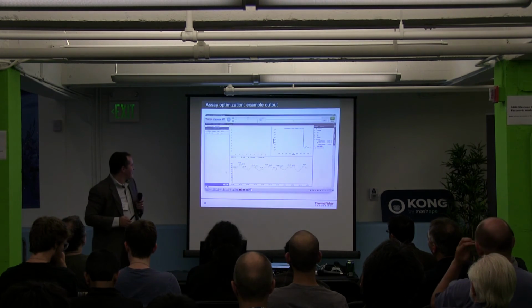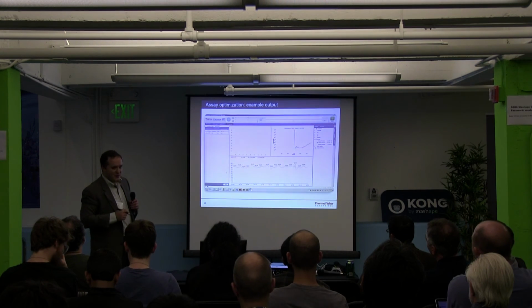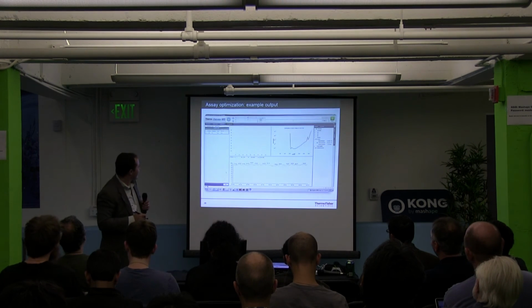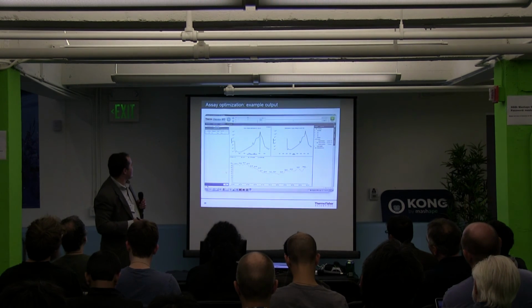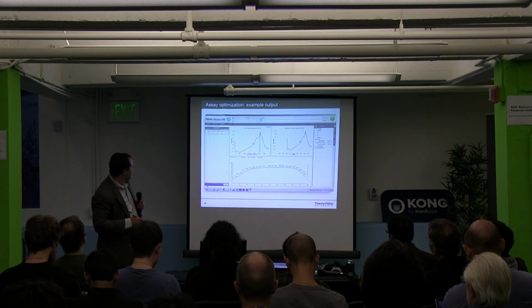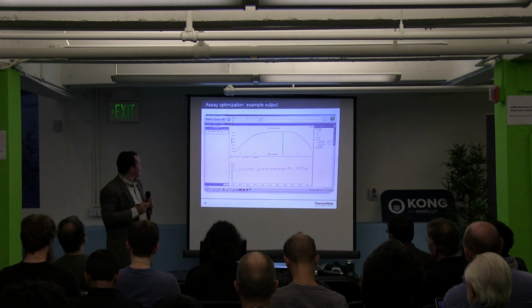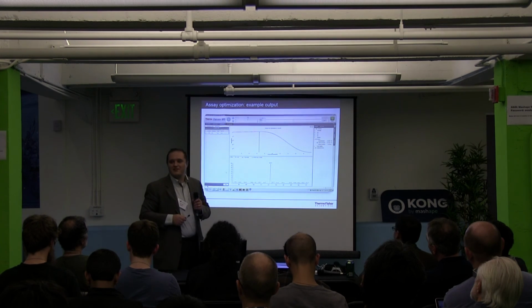Each step we see here is a run of an optimization function. So it's spray voltage, that's one. It's only a minute long. This is the longest step. Okay, it comes back, sets the state, runs another, and so on. So with that, I will stop for questions.